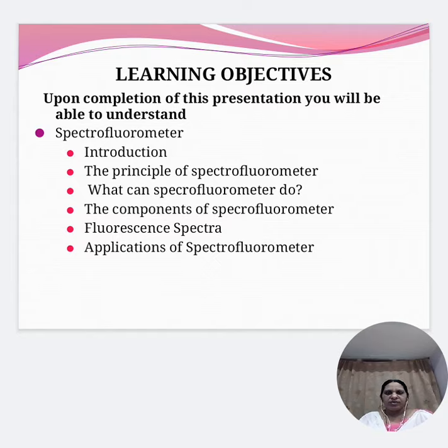Learning objectives. Upon completion of this presentation, you will be able to understand what is a spectrofluorometer, the introduction, the principle of spectrofluorometer, what can spectrofluorometer do, the components of spectrofluorometer, fluorescence spectra, and the applications of spectrofluorometer.